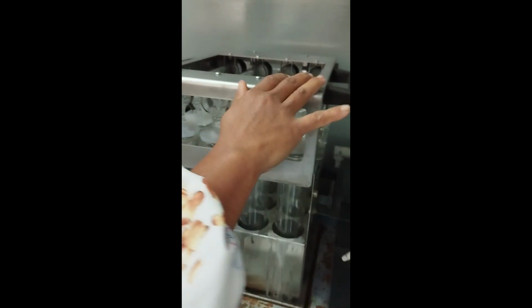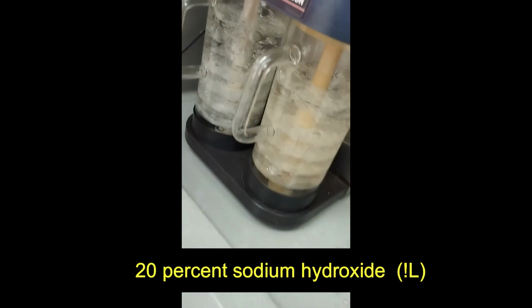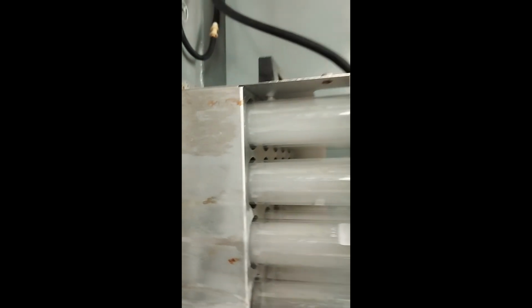Digestion. Okay. On this sodium hydroxide and water. So you can see digestion and fumes. Okay. After 1 hour I will close this.